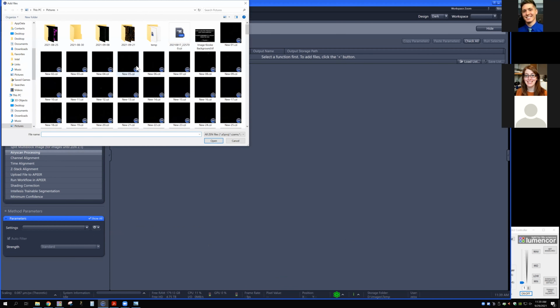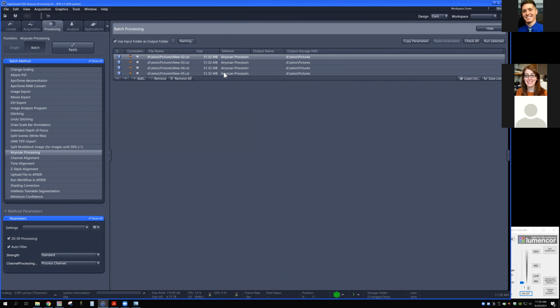And I think that these were raw Airyscan, so I'm just going to pretend and pick a bunch of these, if you don't mind, and you can see them here.